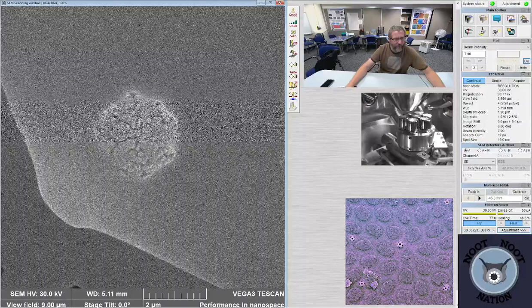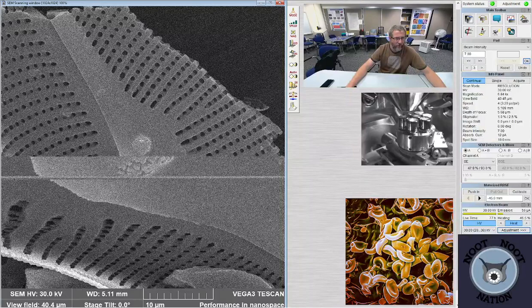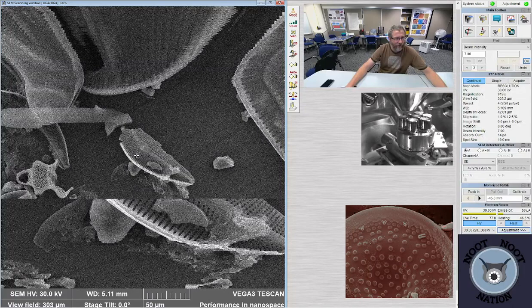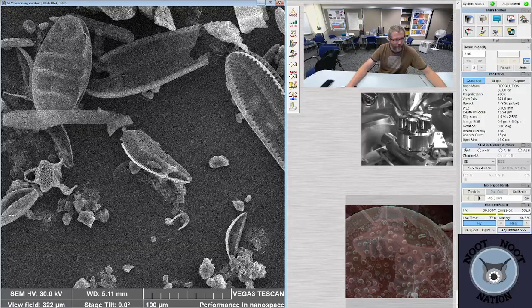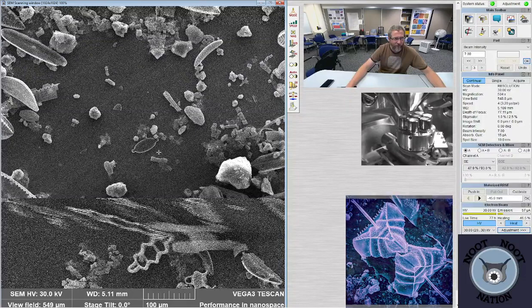That's the stigma, and it's like star-shaped. Super cool. If it's really Cymbella mexicana, which I think it is, that also has really cool external, alphabet-like pores, which we'll take a look at when we're done playing around with some of these other things. This is Terpsinoe, this is Amphora, Cymbella's everywhere. That is Caloneis amphisbaena.